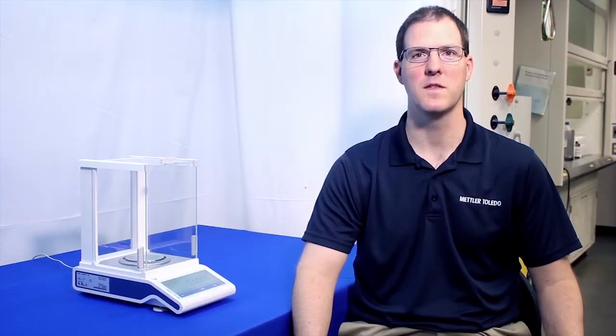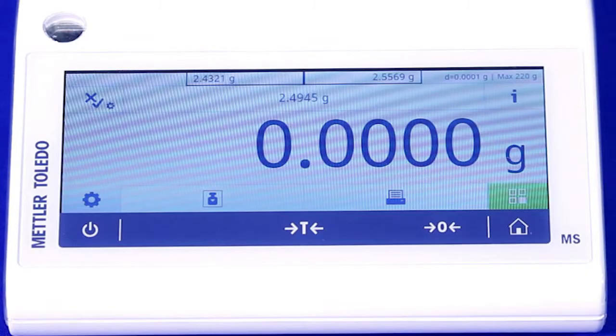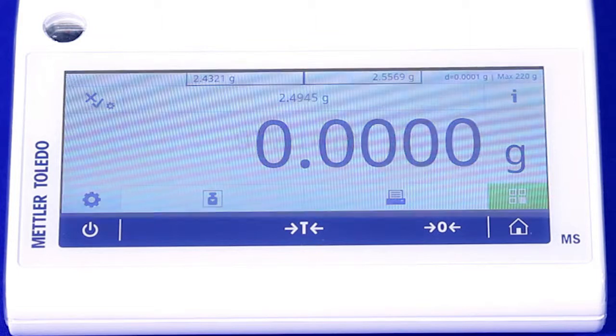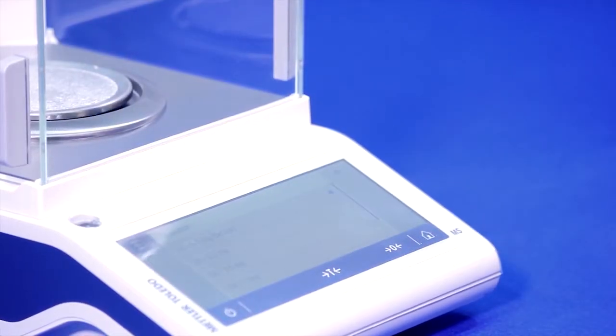It's one of the most sophisticated balances we've ever built and also the simplest. Let's take a look at how simple it is to use. It all starts with the screen. The 7-inch TFT touchscreen is 91% larger than its predecessor and operable when using gloves.